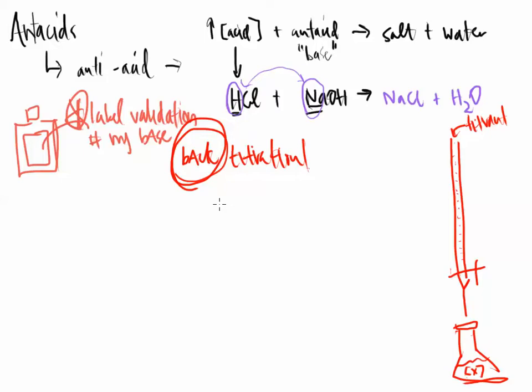If you don't get to watch the entire video series before you titrate, it's probably going to be perfectly okay because the process of the titration is the same as before. You titrate using a solution, and you're titrating a solution in your flask. You titrate until the color change happens. So the whole idea and concept of titration doesn't go away. So we need to talk about how this is going to be a little bit different.